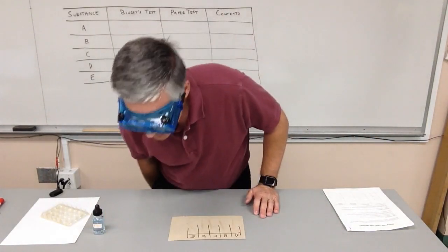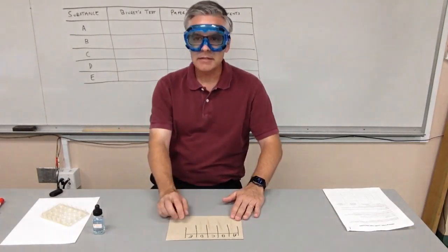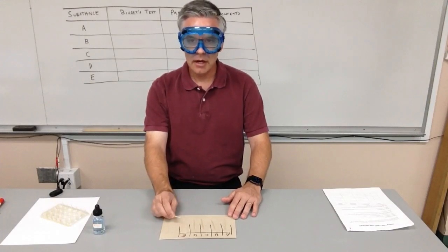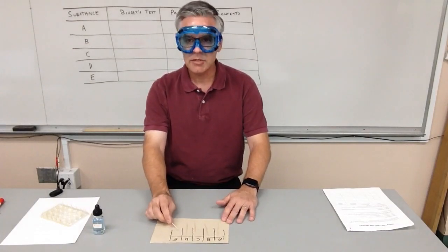And so the first thing I want to do is set my fat test up. It takes about 10 minutes for these things to dry on a paper towel, and so we're not going to wait that 10 minutes. I did another one ahead of time to show you the results.